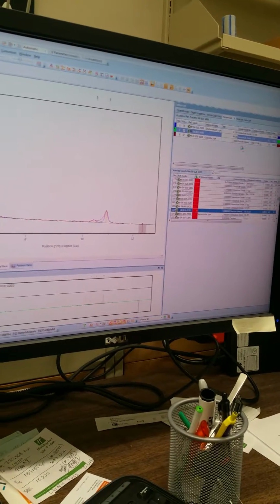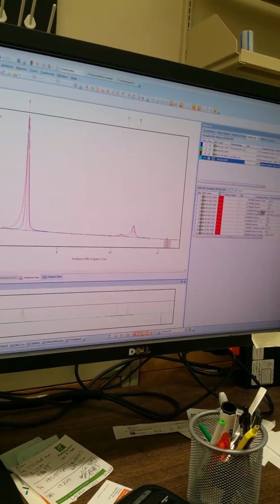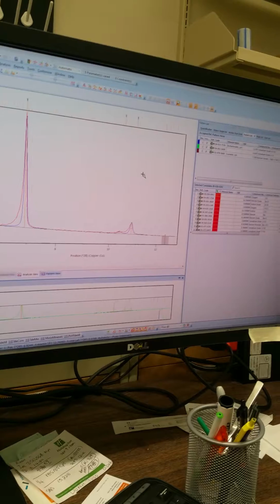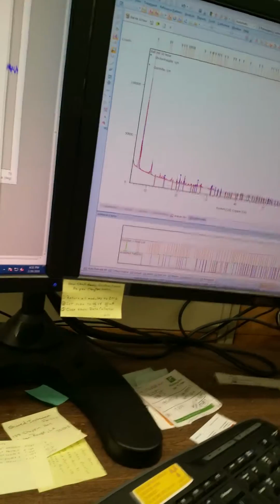Oh, so you have to look for them. You have to keep looking. Sometimes I spend 4 or 5 hours on this because this is a big library. And also it'd be good always to look at the literature so it doesn't get confused.